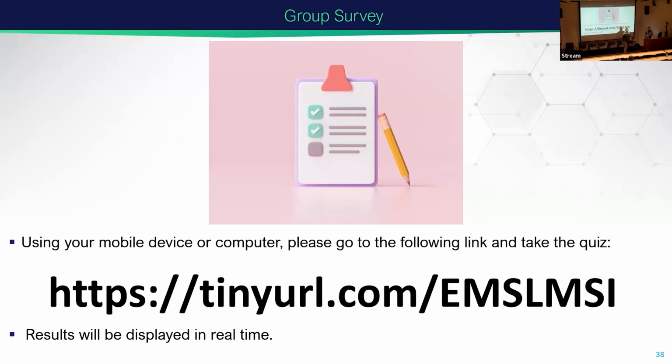Hi, thank you. I'm kind of curious, what does the data size and computing power look like for this kind of work? Yeah, I can comment on the data size right now. It depends. It can be in terms of megabytes, but we actually have an imaging run right now where we're imaging that entire membrane off of the actual rhizochip from a poplar root that was grown with endophyte. That's going to be about 1.1 terabytes of raw data.